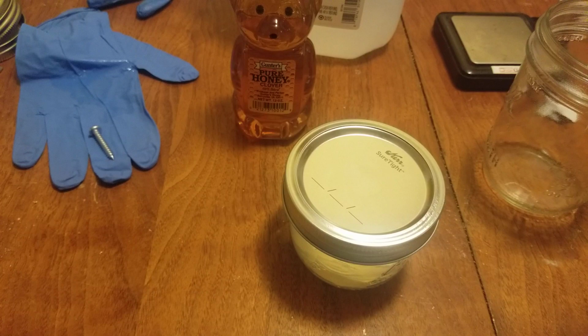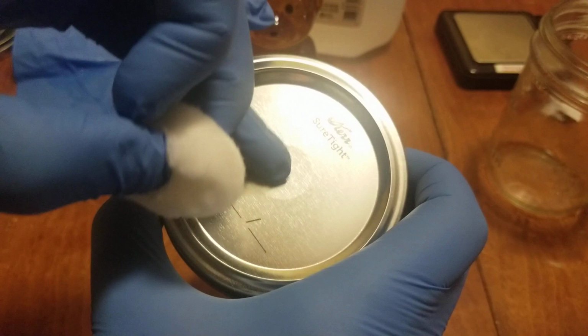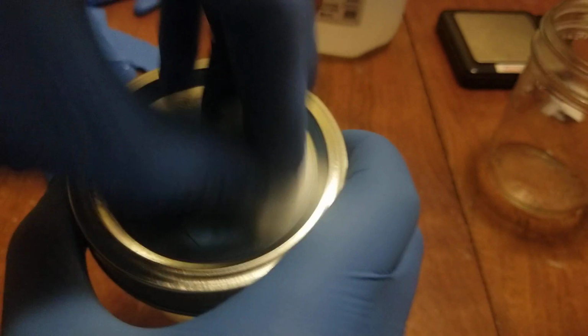So here's a cotton swab that I have just pre-sterilized with alcohol. It's 3 in the morning now, I think. I don't know. I'm tired, guys. So basically what we're going to do is take our cotton swab and swab right around this little ring part, make it nice, and let that air dry.